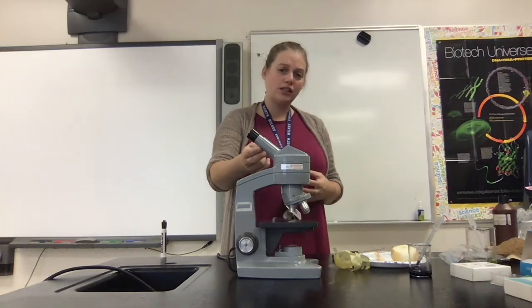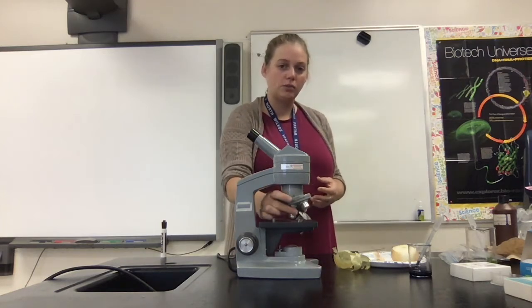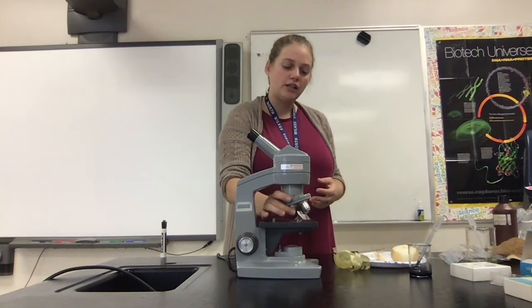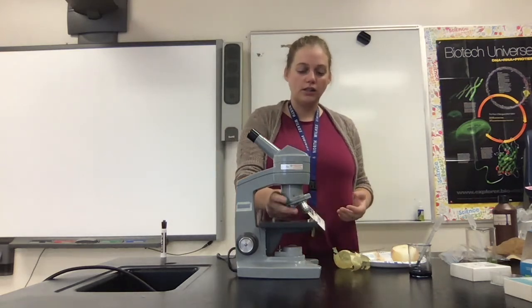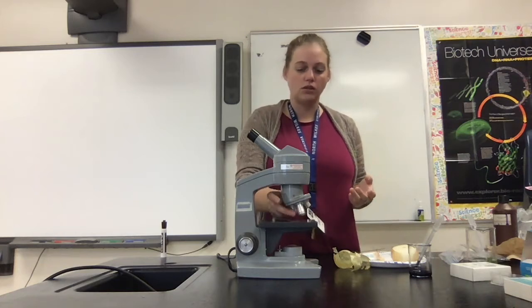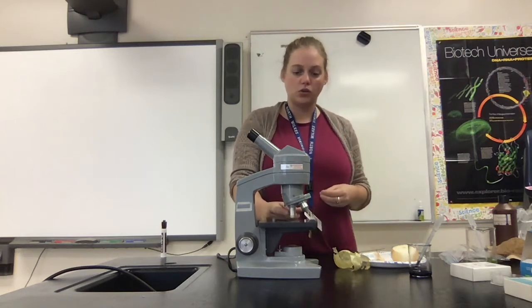In addition to the lens in the eyepiece, we also have lenses on these objectives that you can see me spinning here. And the objectives have different lenses of different powers. The smallest objective that we have has a lens that magnifies something to be 4 times larger than it normally is. Our next objective has a power of 10, which means it magnifies something to be 10 times larger than it normally is. And our strongest objective on this microscope has a power of 43. So that means it's going to magnify something to be 43 times larger than it normally is.